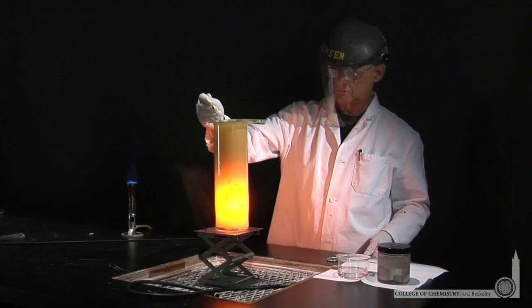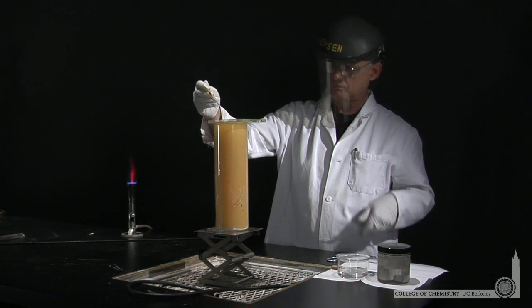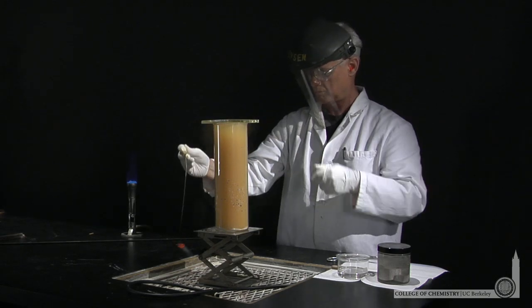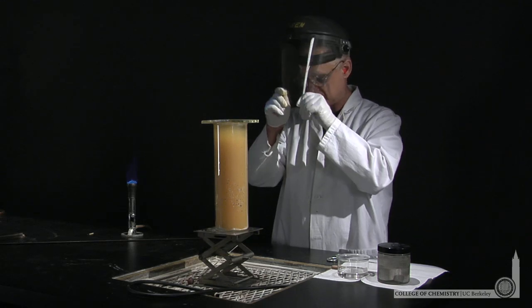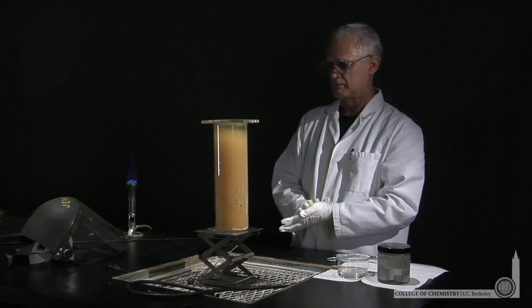The reaction between sodium and chlorine, of course, forms sodium chloride. We typically know that as table salt. And Lonnie's prepared some in advance — he has white, purified table salt that he can show us.